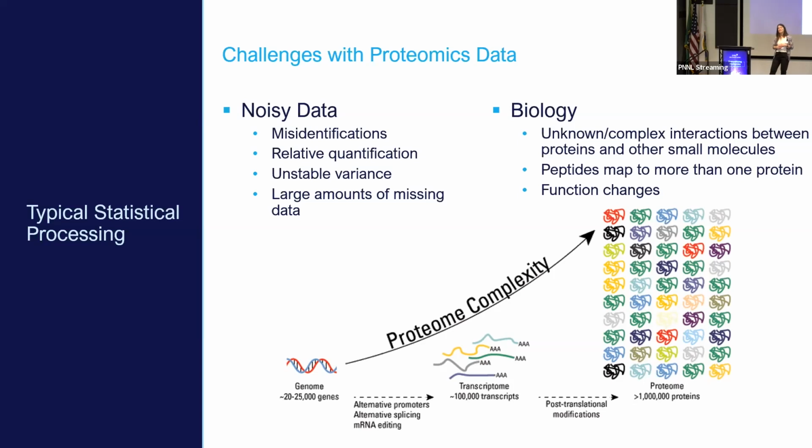Can you repeat that, please? Yes, I believe the question's asking that if you do the analysis between samples instead of groups, can that actually help remove batch effects? I think the answer is no, and you can talk about maybe Malbacher here. Right. Yeah, I haven't seen that as an approach for removing batch effects. We've actually been studying batch effect correction methods, and Damon can talk more about that, either if you have questions online or during one of the networking breaks.